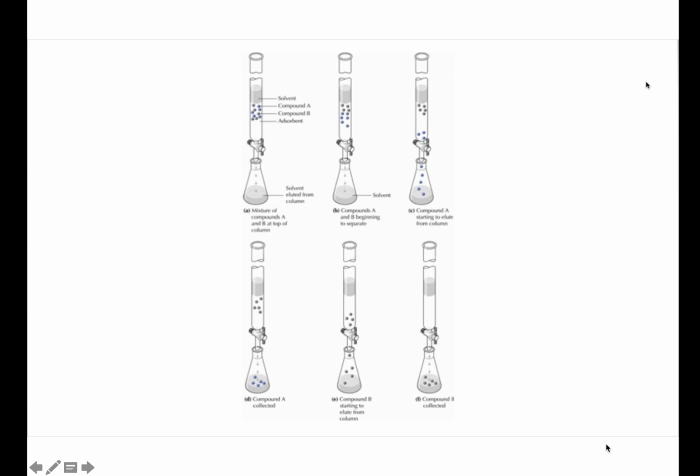By increasing the polarity, the purple one will come as well. If we are using too polar a solvent, separation is not doable. If we are using too weak a solvent, the blue can stick on the stationary phase and it's not separable as well.